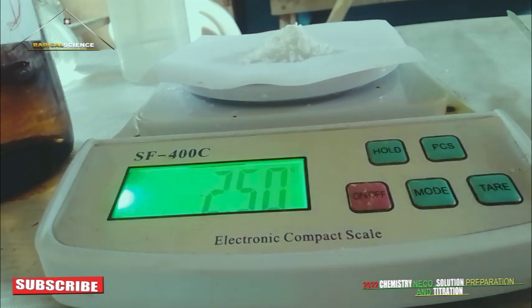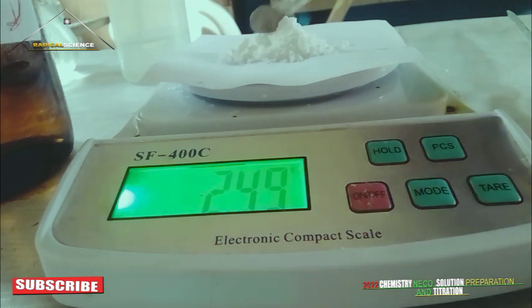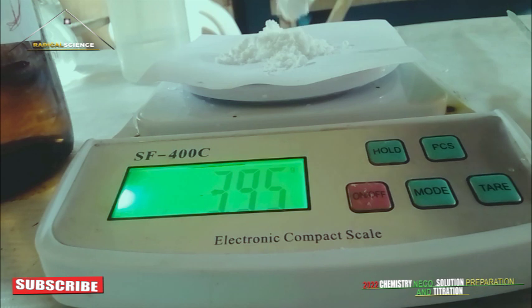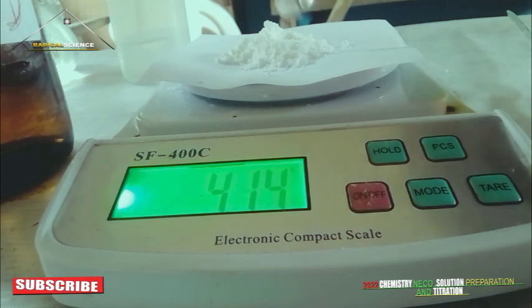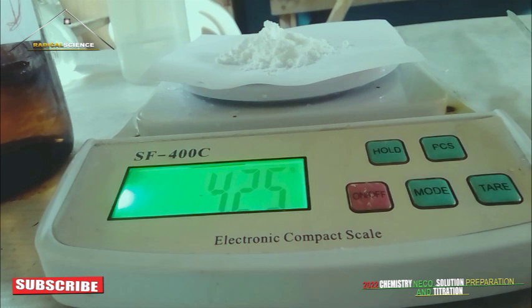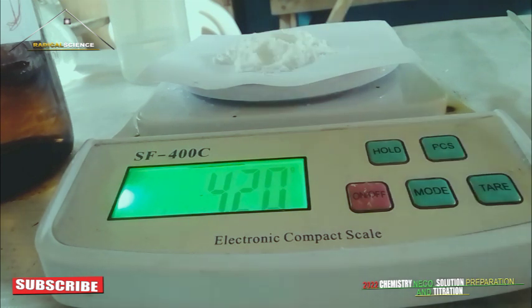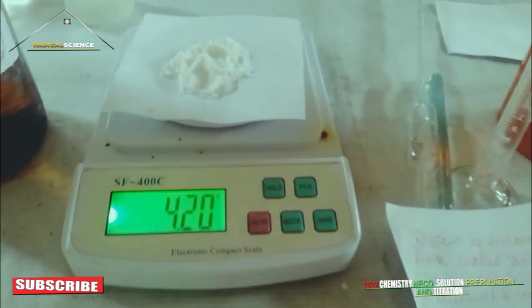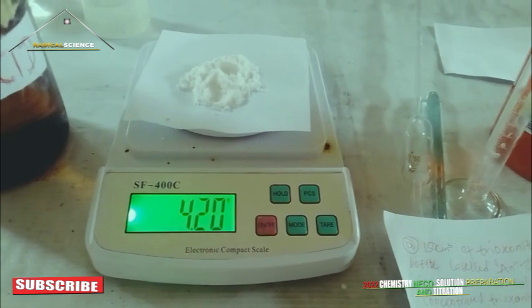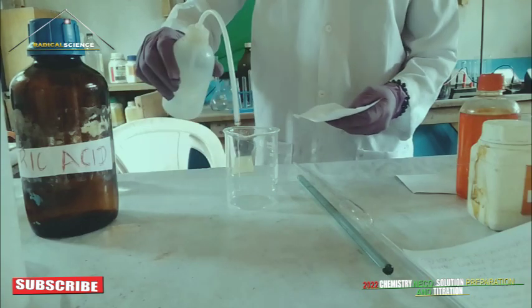Okay, at this point we have our 4.20. You can see it very well.